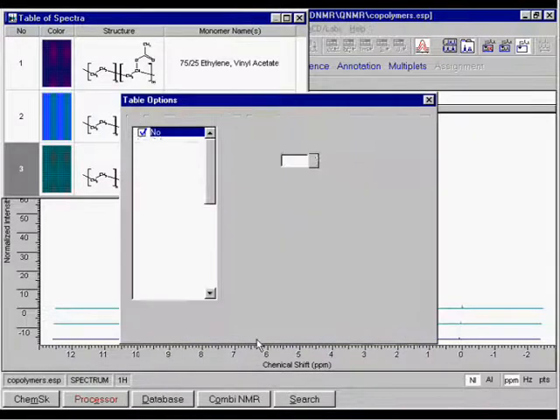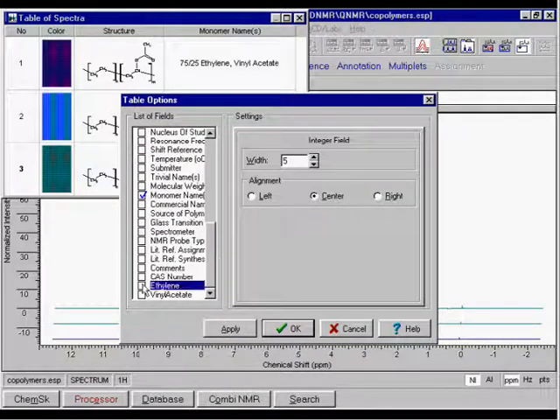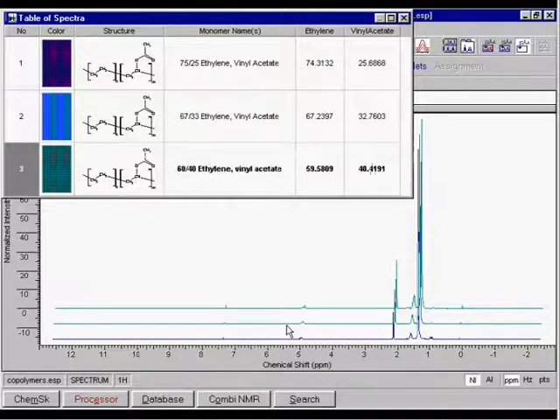Now compare the values that we have calculated to the ones that are incorporated into the names of the polymers. As you can see, the agreement with the Quanalyst results is extremely good.